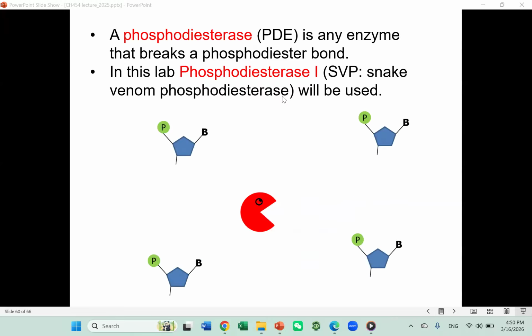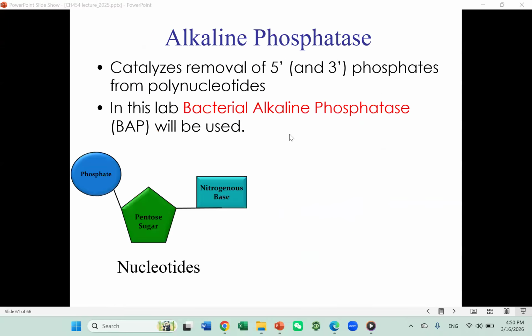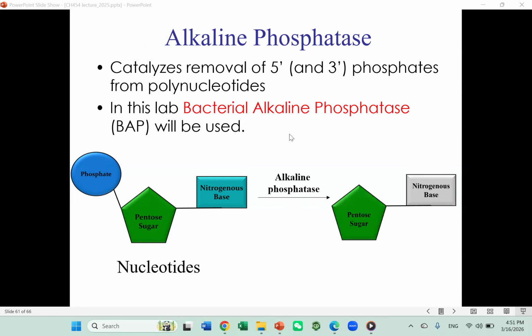into the individual nucleotides. The phosphate is still there, but the nucleotide is still too polar, so it is not easily separated by HPLC. So we have to apply another enzyme to cleave off the phosphate and convert the nucleotide into a nucleoside.